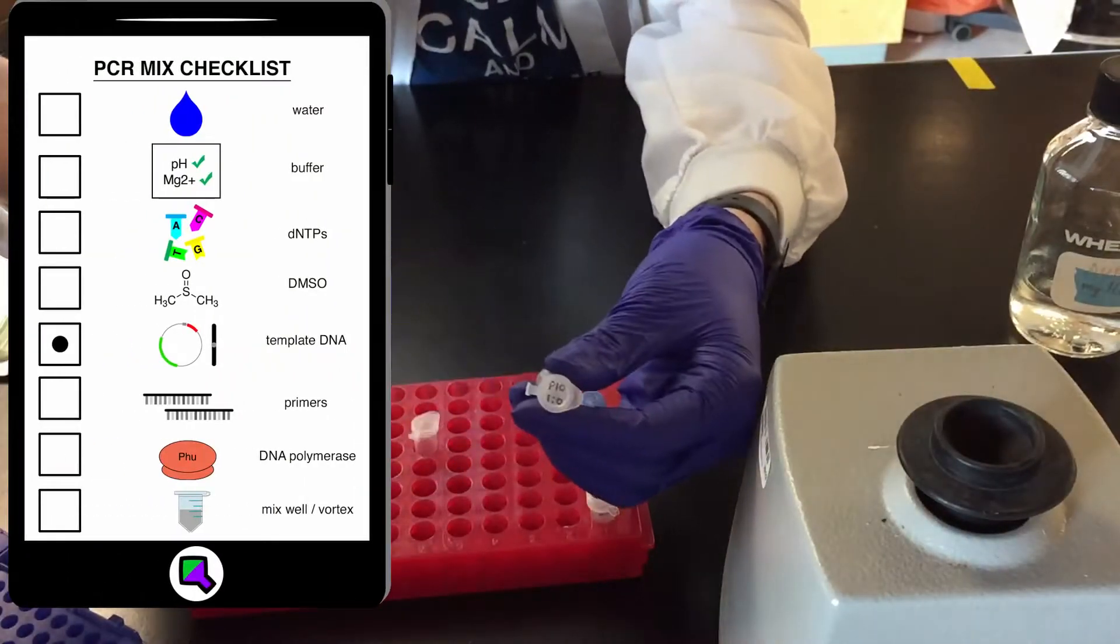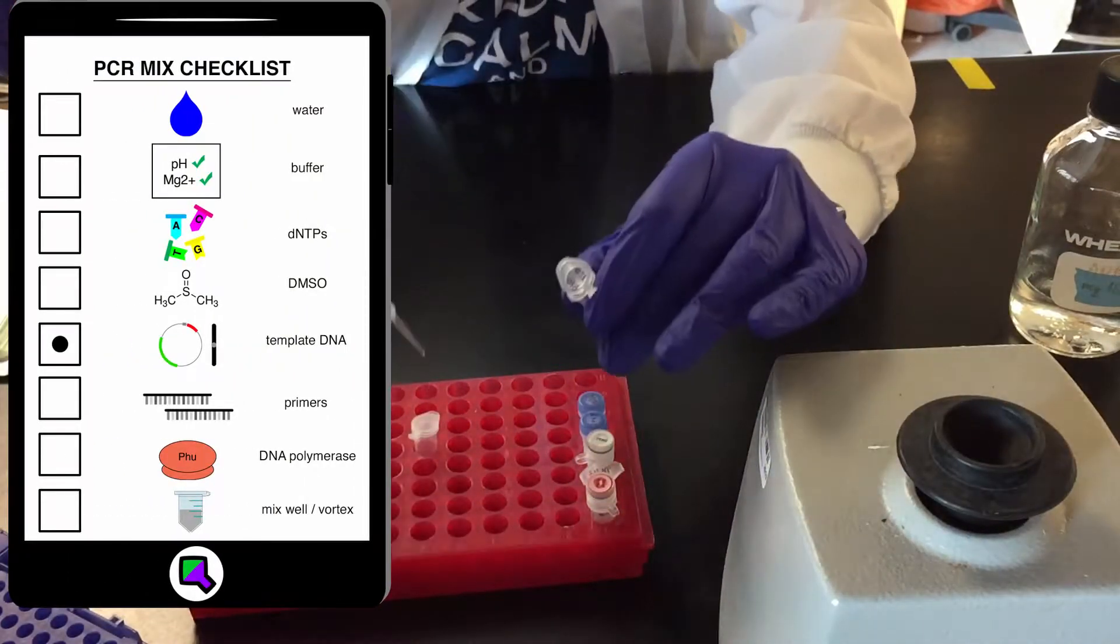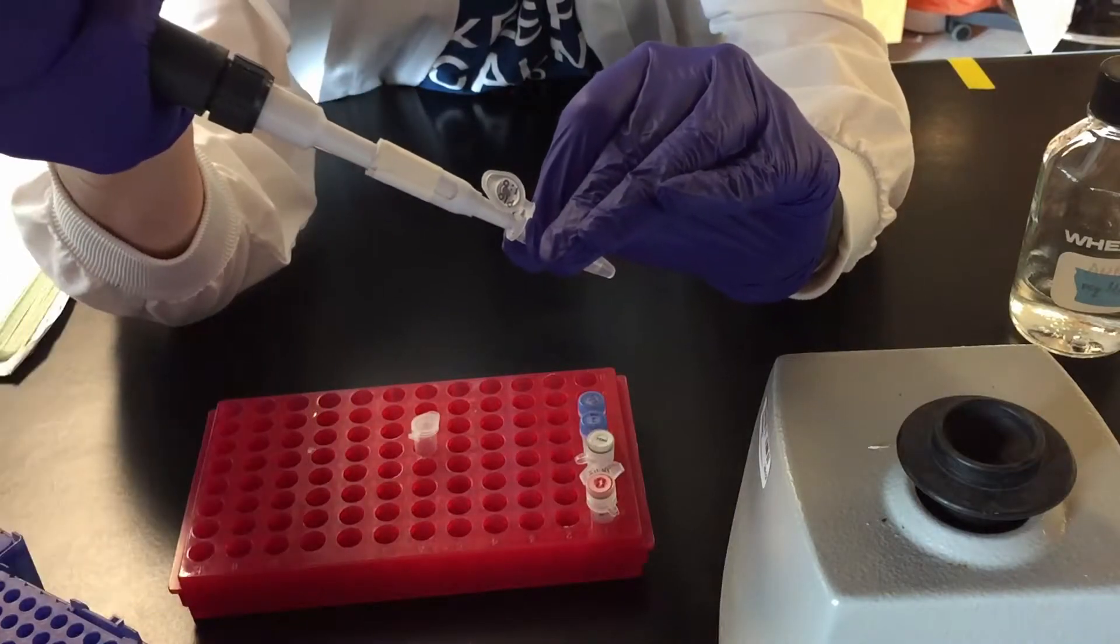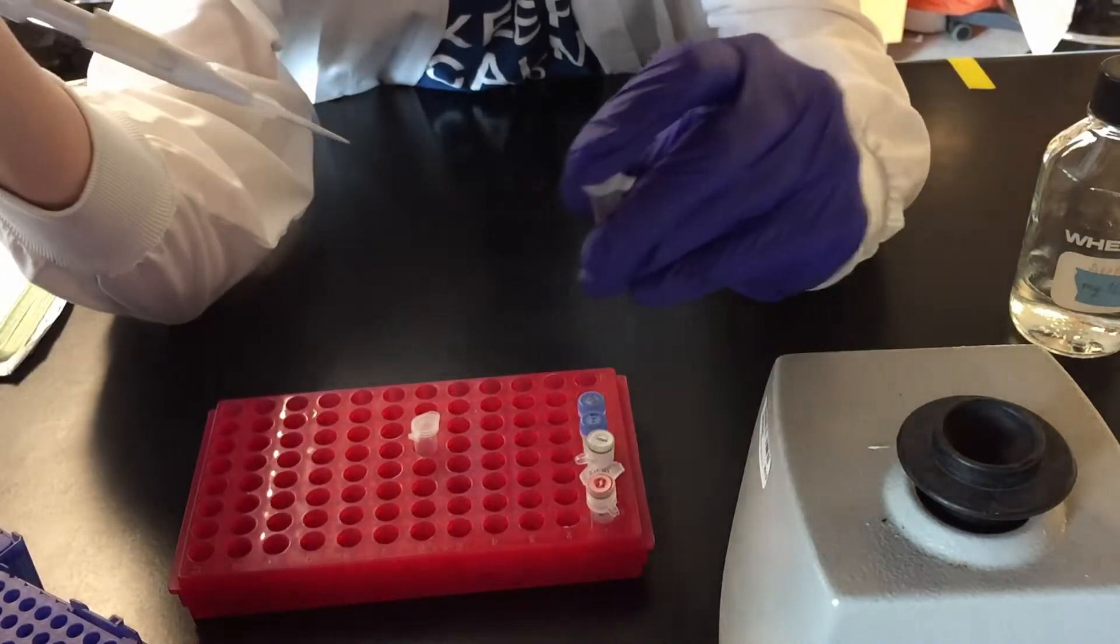The template DNA is usually either a plasmid for some sort of cloning or a genomic DNA prep for whatever organism you're testing.